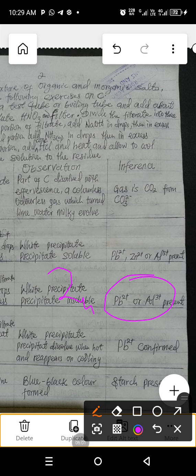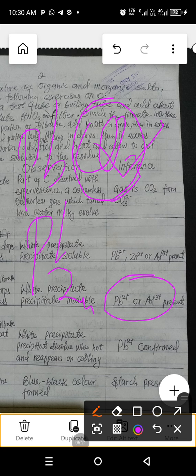All right. So next, remember that what we are having as the filtrate is lead carbonate. And we have identified the carbonate present there, as well as the gas that evolved through the carbonate. And so what we have now is the lead ion, which we have narrowed with aluminum ion.